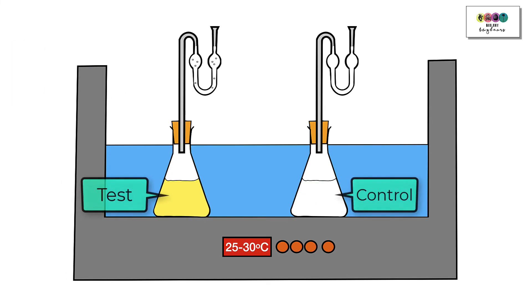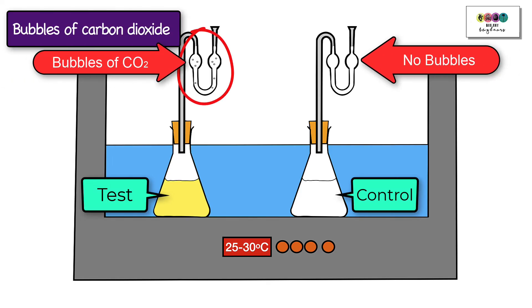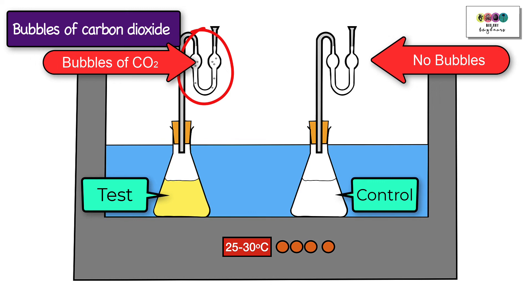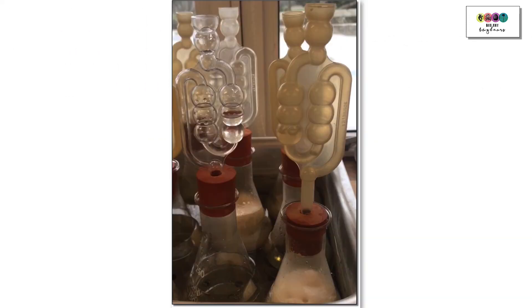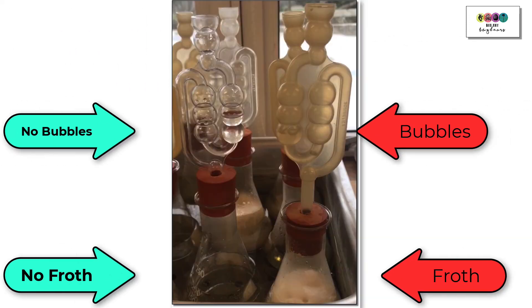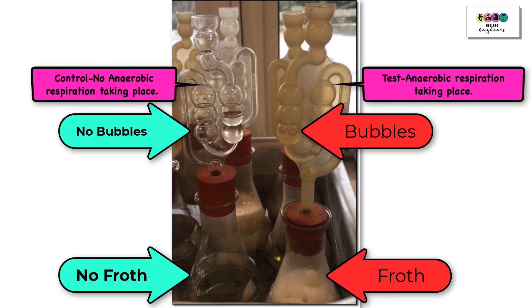After a short period of time, if you look at the test apparatus's fermentation lock, you'll soon be able to see bubbles of carbon dioxide and the lime water turns milky. On the right is the test and on the left is the control. You can see bubbles of CO₂ in the fermentation lock and froth on the right, whereas on the left there are no bubbles of CO₂ and no froth.